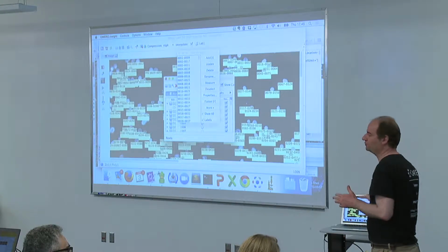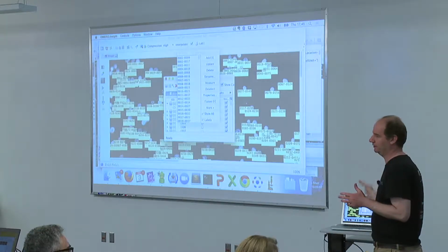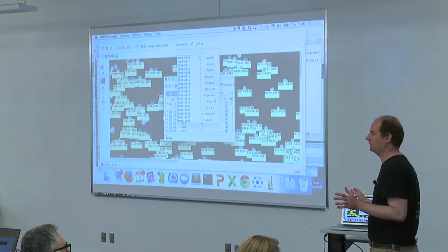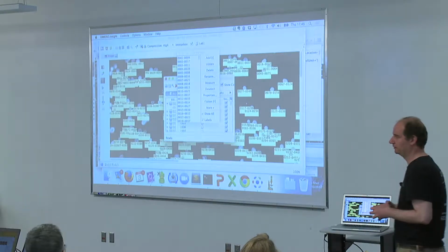And saved into OMERO everything that the recorder recorded as I was doing it right here. But this is still work in progress. I do not even have a prototype to show you at the moment. So we are aware of this problematic.